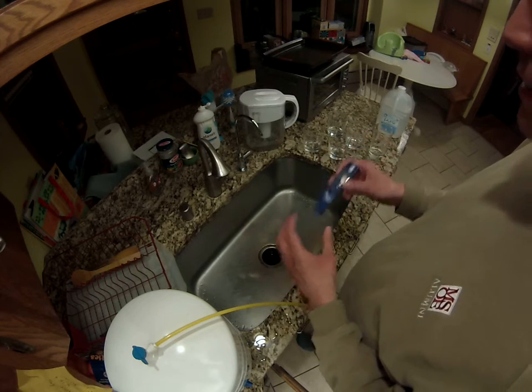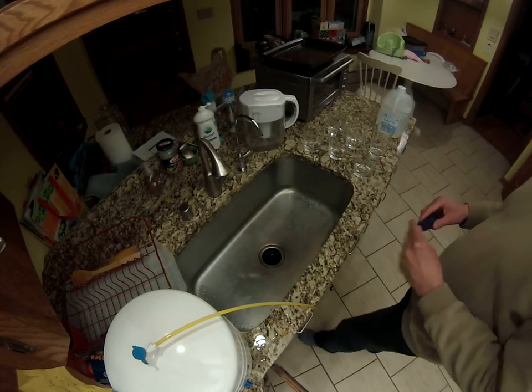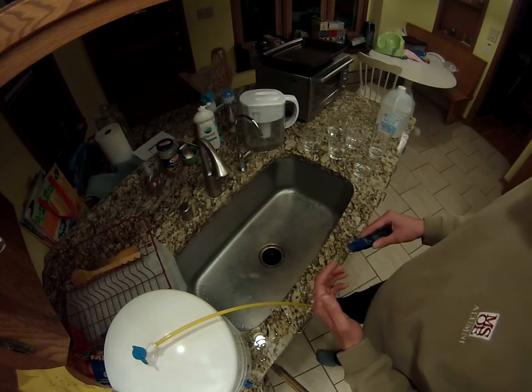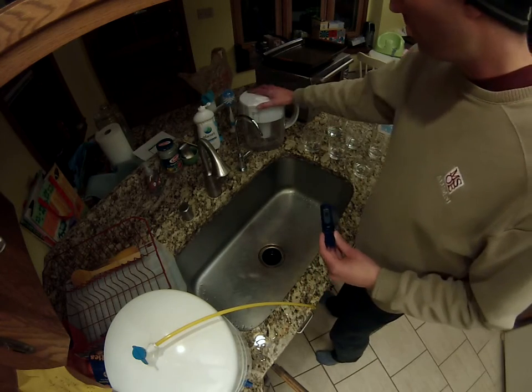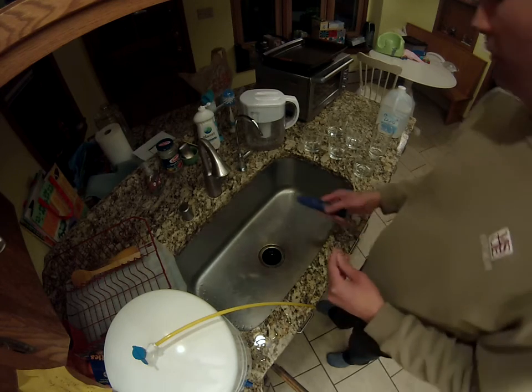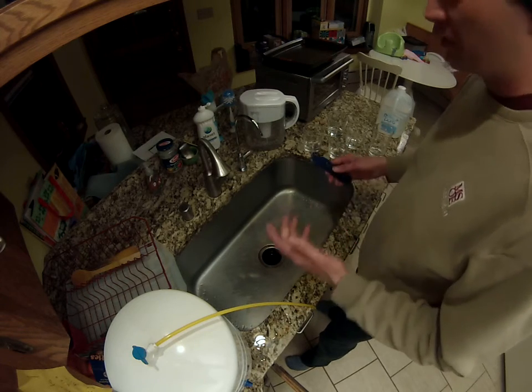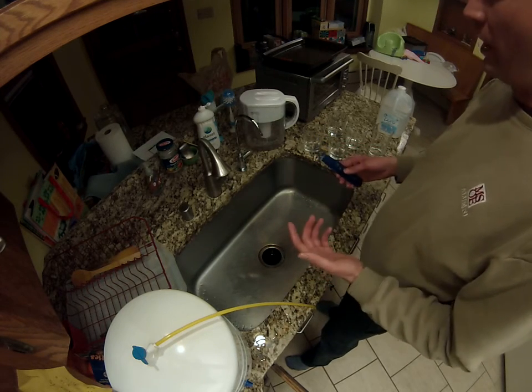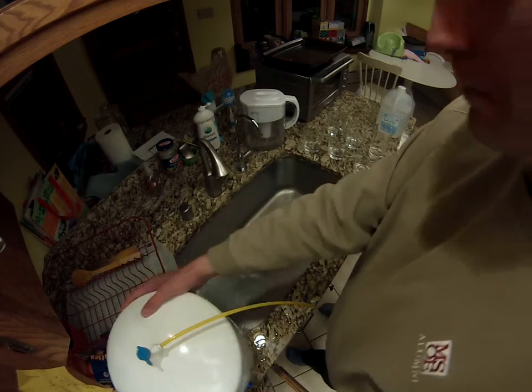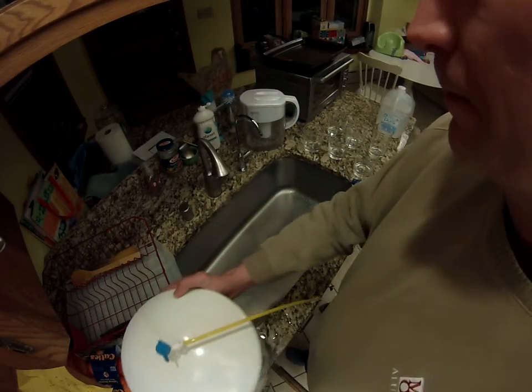Still, for our purposes, the TDS tester is a pretty good feel for where we want to be. So today we have tap water from the city of Milwaukee, which is regarded by some as some of the best tap water in the country. We're also going to run that through a Brita filter, which is a pretty popular consumer product. It will filter the chlorine and mercury out, but it does miss some things like lead, fluoride, and benzene. We also have a reverse osmosis system from Apec water, and that should catch all of those things.